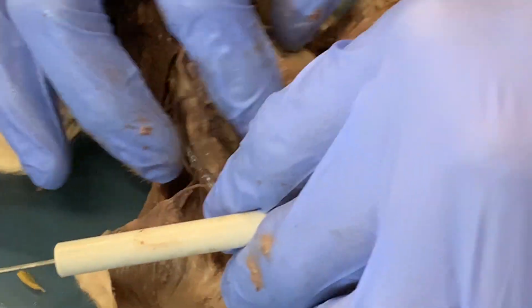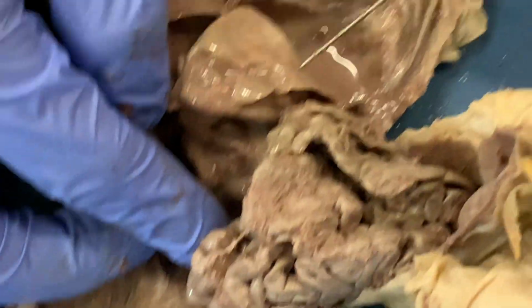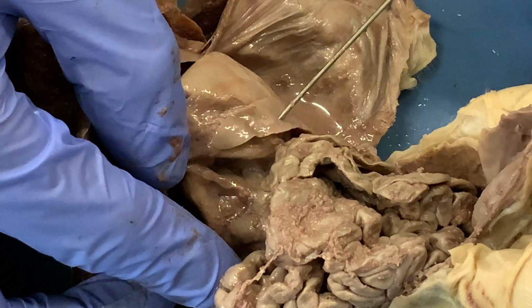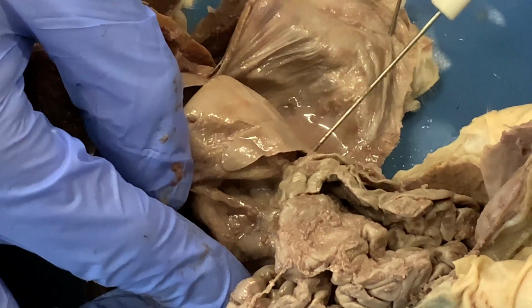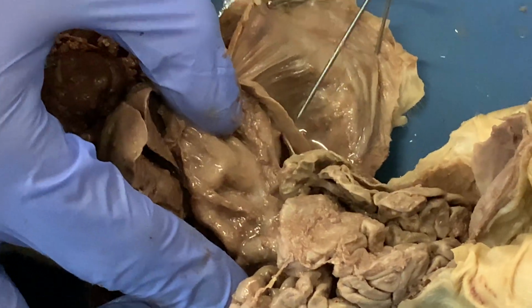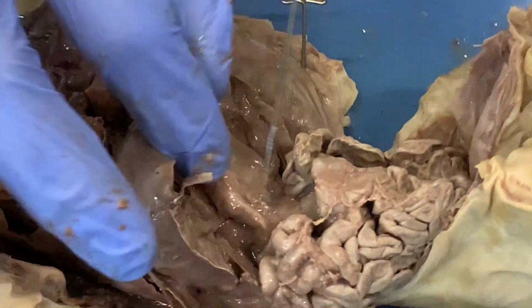Again, connected to that same junction by a duct that is kind of beneath us here is the pancreas, this organ right here. It's a kind of thin, finger-like organ. It wraps around, and on the back side of the stomach right here is connected to the beginning of the small intestine.